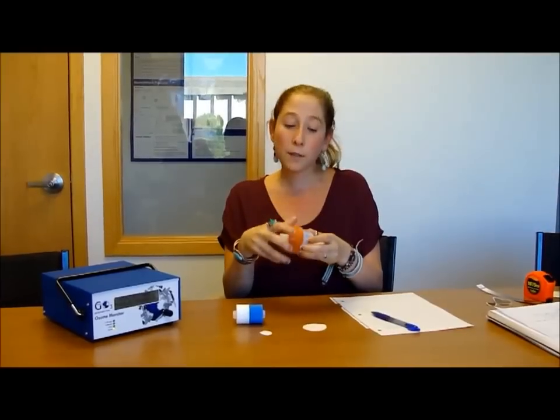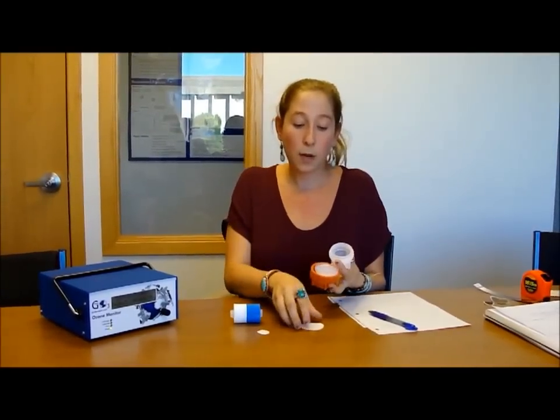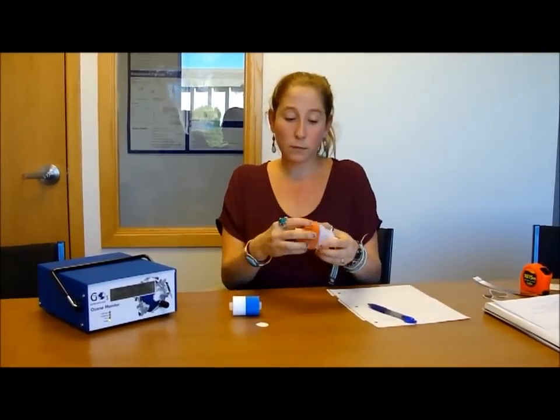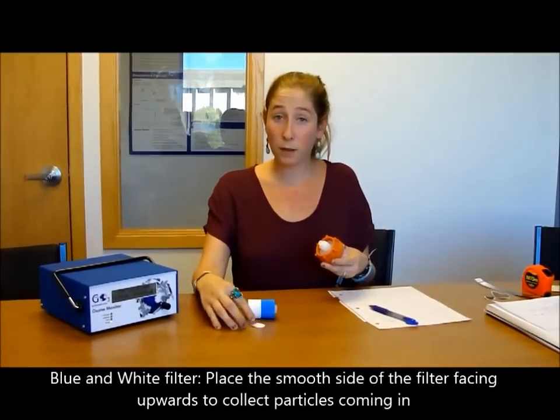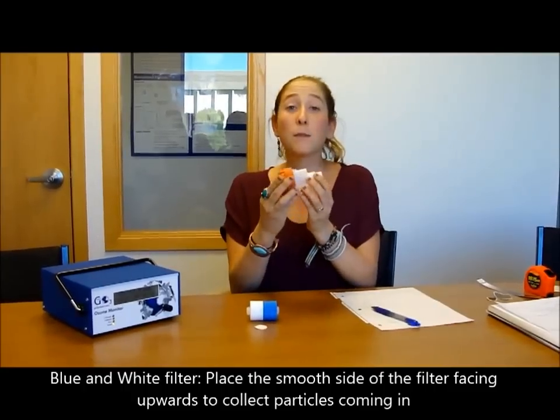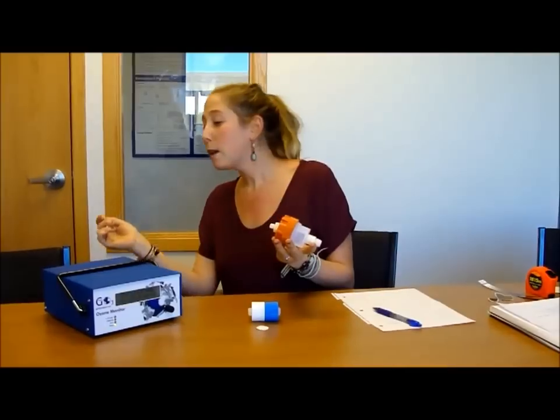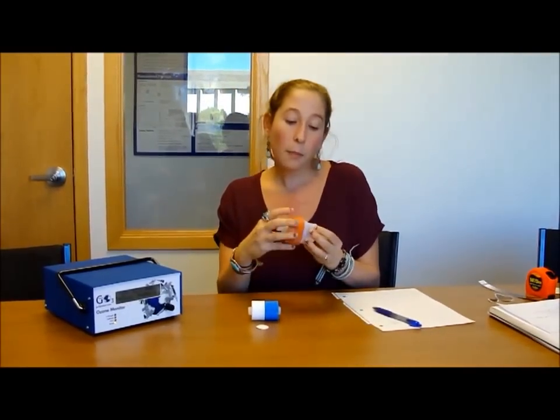You're going to place a clean filter into your housing. So if you have this orange filter, you're going to put this bigger one into the filter housing. Likewise with the blue and white, you have this smaller filter there. Now these housings will be connected to your tubing, which will be inserted into the back of your ozone monitor.